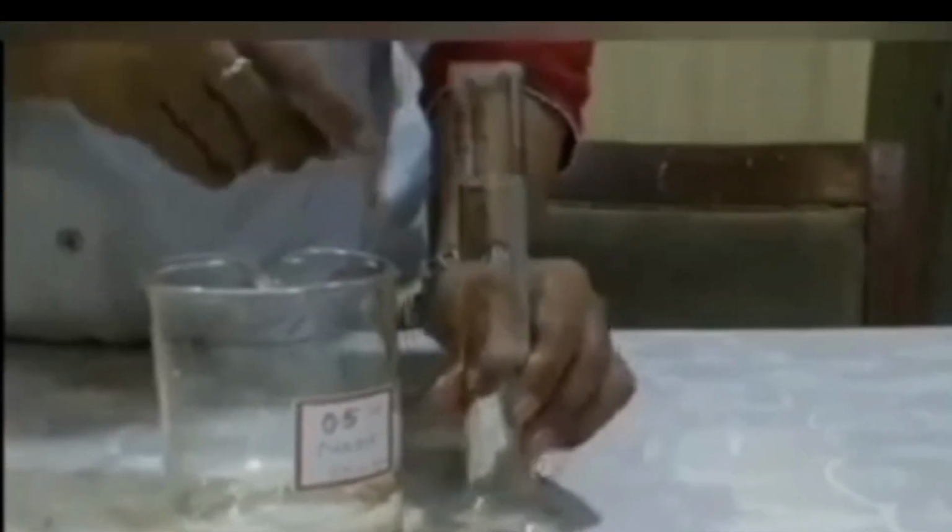Now in the second step, we will take one small beaker. We will take 50 ml of this 0.5 molar NaOH and transfer it into the small beaker.